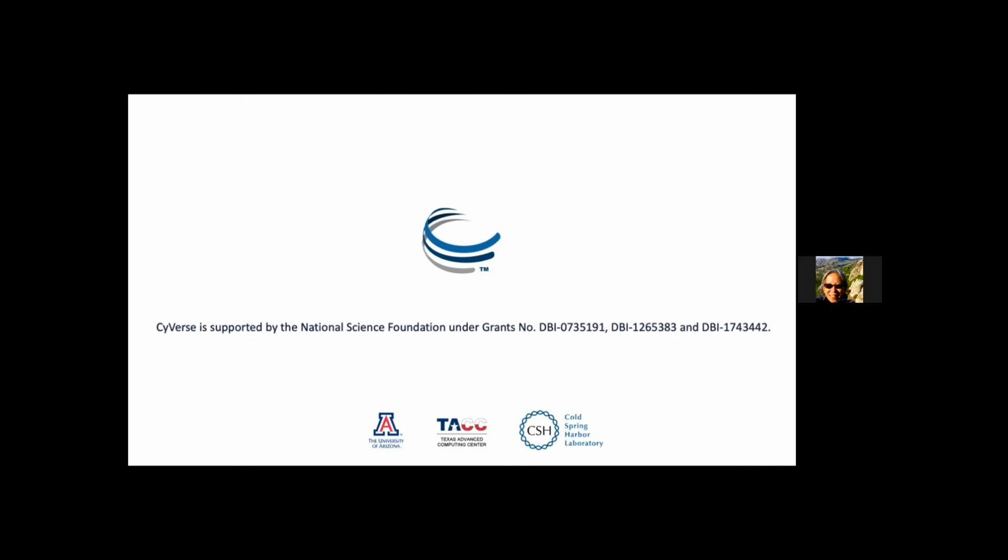Okay. Next question, do we need to remove related individuals to run the LEA package, like is needed when running Structure? Remove related individuals in order to run the LEA package. I'm not entirely certain about what's being removed. My initial assumption is no, but I would need a bit more detail to be able to accurately answer that question. Sorry for that. Okay, maybe Karen can type a follow-up later on.